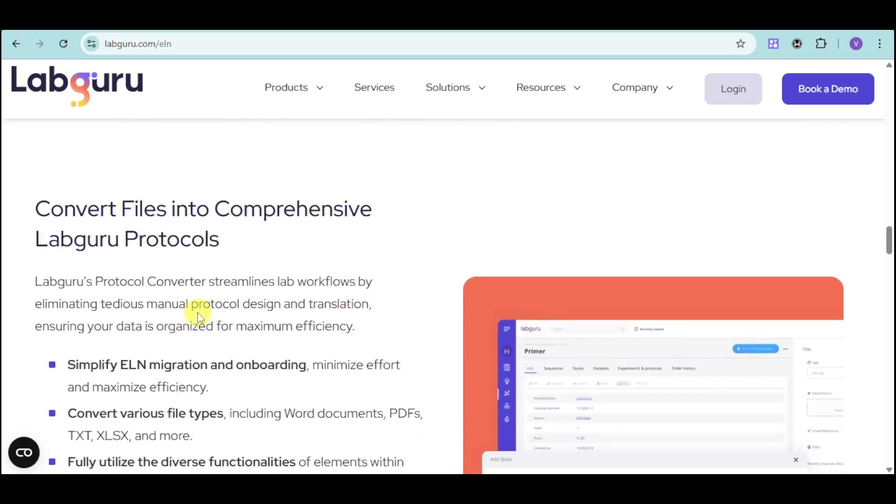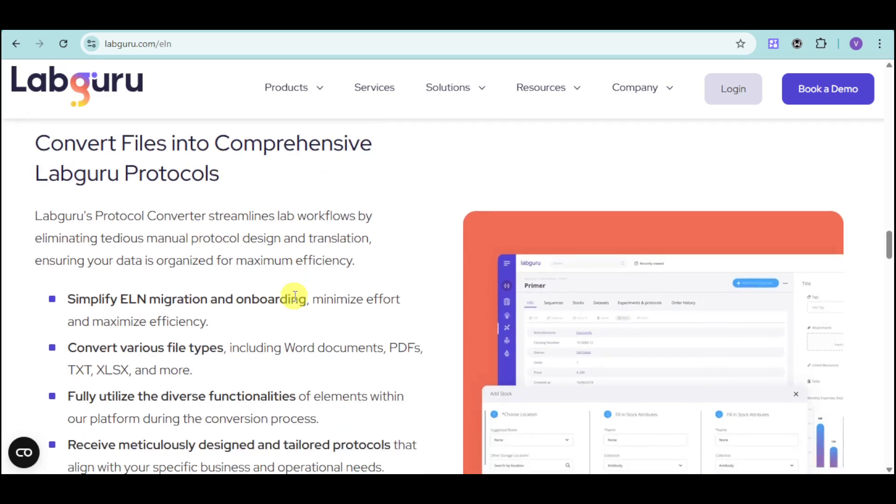You can convert files into comprehensive lab group protocols. You can actually convert Word, PDF, TXT, XLS, and more into the actual comprehensive protocol that you need for your LabGuru.